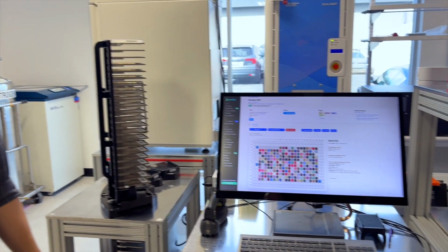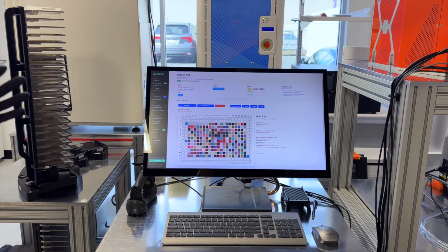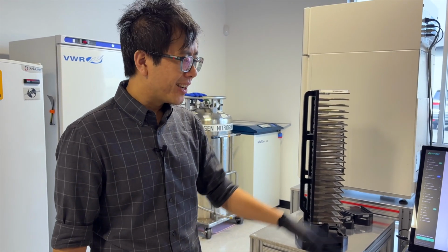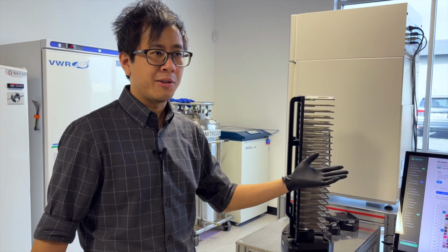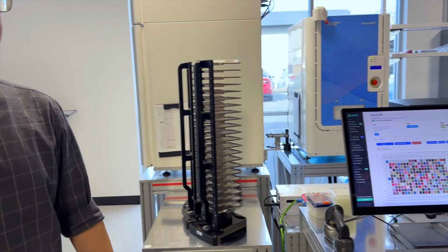Yeah, when you've got a few conditions or a dose response, and you're trying to do it all manually, you'd probably structure it in such a way that you know exactly what conditions you've done in each well. There probably aren't that many conditions. But again, when we're talking about this many conditions, you simply just can't fit it into your brain. You can kind of see from some of the colors here that we're randomizing it as well. And so I definitely won't know what went where. And so using this to just do all of your planning first is a major cut, or at least addresses one of those cuts.